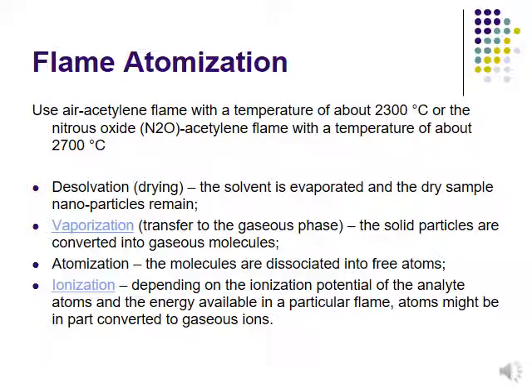Next is ionization, which depends on the ionization potential of the analytes, so basically it depends on the kind of sample, to ionize the sample to become gaseous ions.